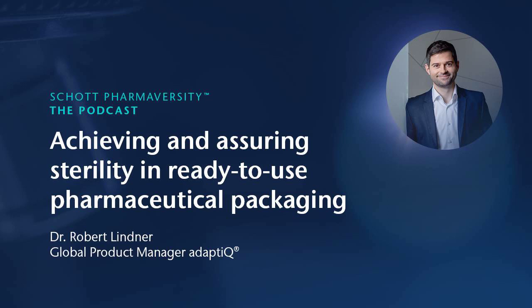The sterility assurance level gives you the mathematical odds that you have a sterile product or a sterile object in the end. And this can be assured by reliable processing, so we can qualify and validate sterilization processes in order to be highly confident that the odds of having a compromised product, that means any surviving bacteria, microorganisms, spores, viruses, etc., on your product, are very, very low.